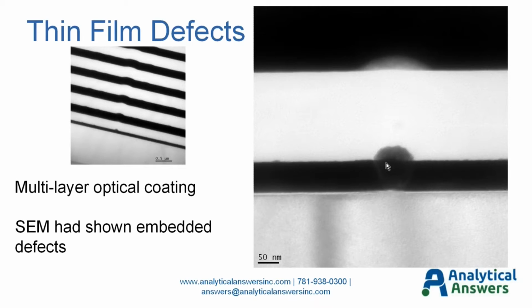This is only a 50-ish nanometer particle. Again, the sample thickness is on the order of 10 times that. So you have areas where this initial film has been undisturbed that are superimposed on the particle itself, which is why you see what appears to be that layer running unadulterated right across the particle.